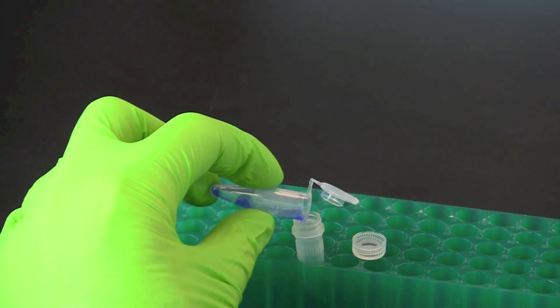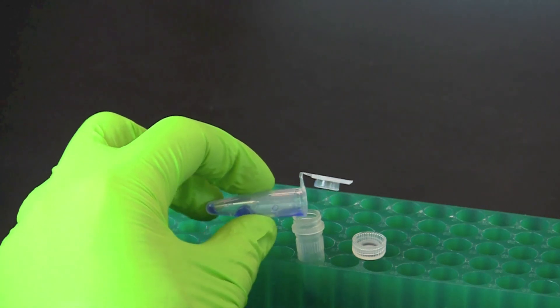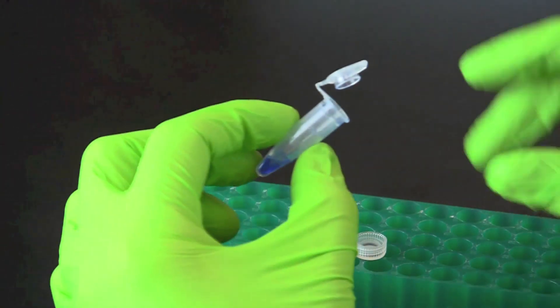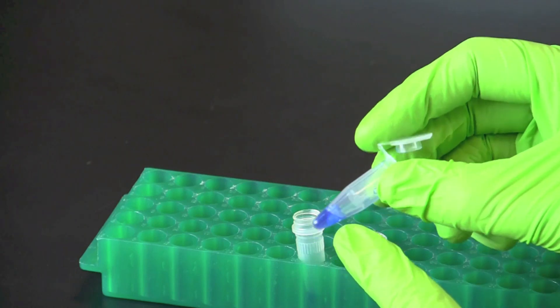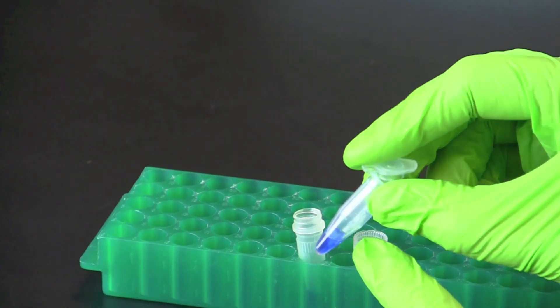Following the room temperature incubation, carefully transfer the buffer from the microcentrifuge tube into the screw cap tube by pouring. Be careful not to transfer any of the fish muscle tissue.